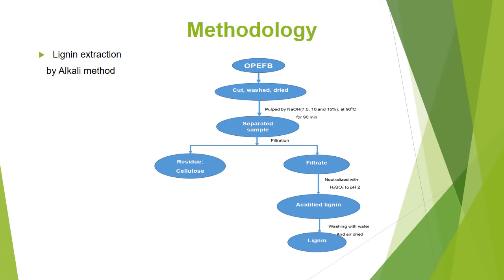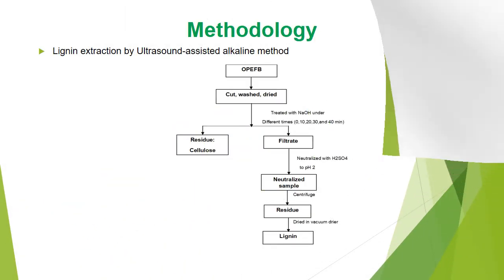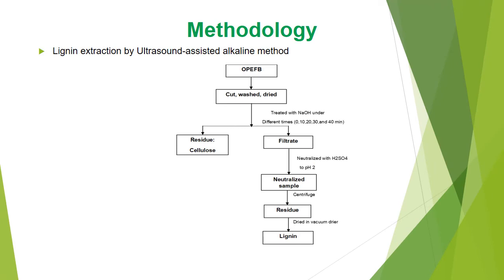Methodology. Lignin extraction by alkali method. This is the first method of my work, and it is the procedure to extract lignin by alkali method. And the second methodology is lignin extraction by ultrasound-assisted alkaline method, and it is the procedure of the ultrasound-assisted alkaline method.